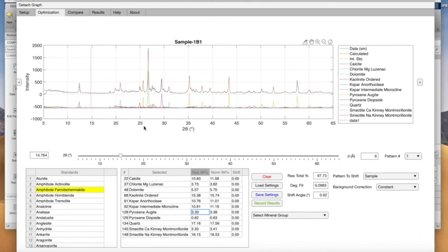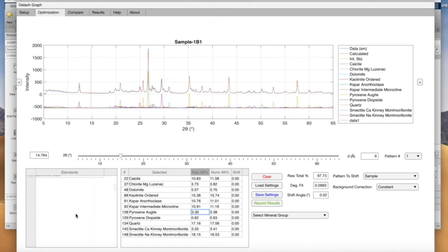See, we have these feldspars here. This is our problem here. We have feldspars in there, and feldspars are hard to tell apart with powder X-ray diffraction. And plus there's solid solution going on, so one sample might have two different compositions, and so on. So I'm going to spend some more time on those. So why don't I go down here.